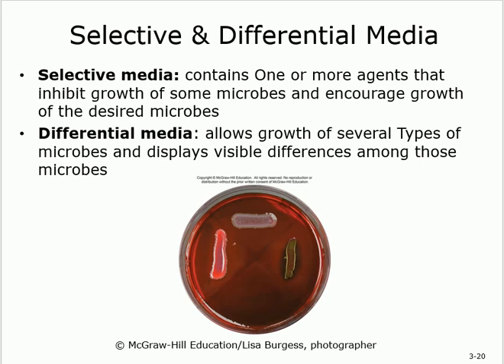So when you put the sample there, 3-4 types of organisms are going to die, are going to be inhibited. And you're promoting the growth of the E. coli, for example. This is called selective. So to remember it, it selects what to grow and what not to grow, simply.